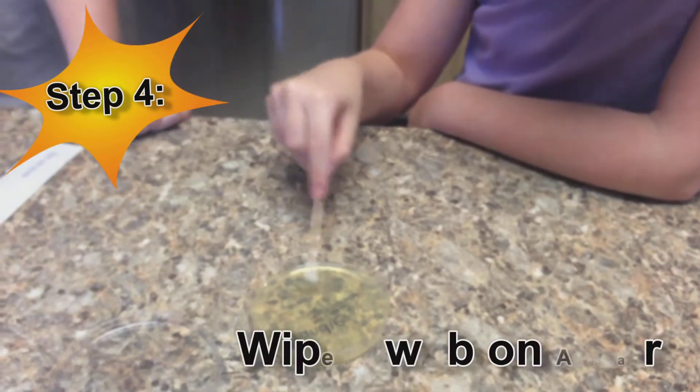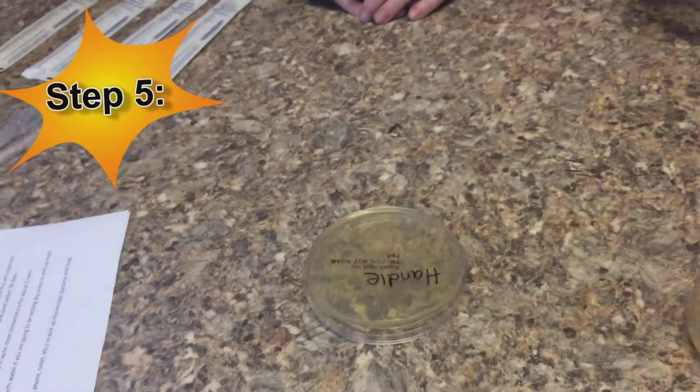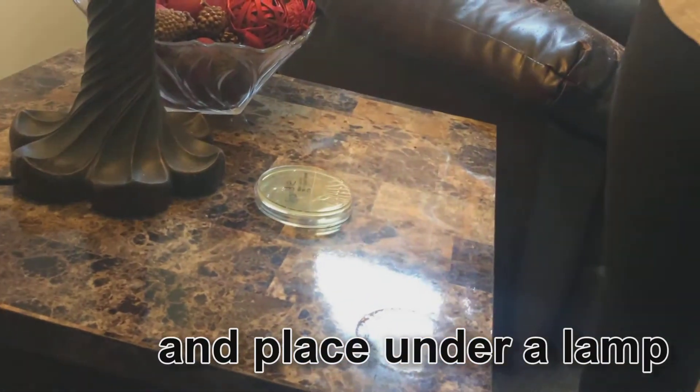Next, simply rub the swab gently against the agar — that's the yellow stuff on the plate — and put the lid back on. The final step is to flip the plate upside down and place it under a lamp. The longer it stays under, the more bacteria you grow.